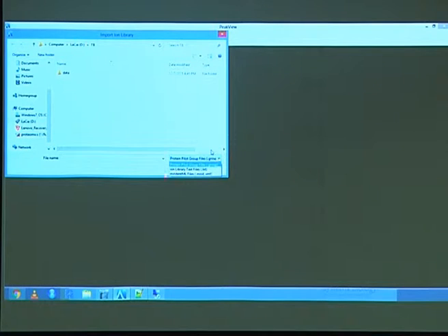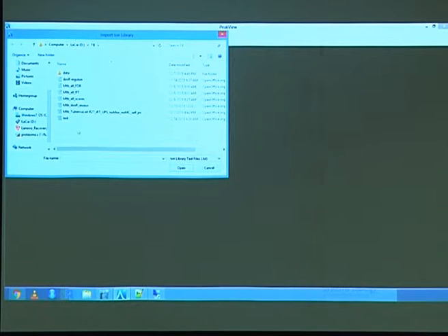They also allow you to upload mzIdentML files. I haven't used that yet, but that should also be a tool. I think Mascot is able to generate that, so if you have Mascot output, you can do it that way.